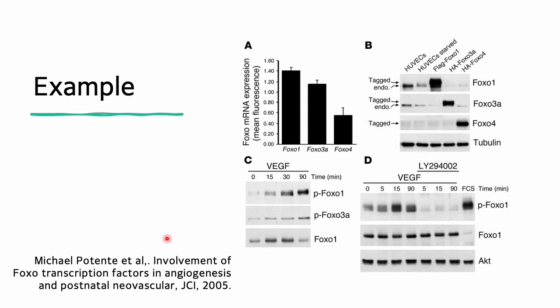Western blot is the only thing you can use to compare the phosphorylated version of the protein. In many cases, proteins are there, but they are activated through phosphorylation. So Western blot is very important in comparing the activation of something.